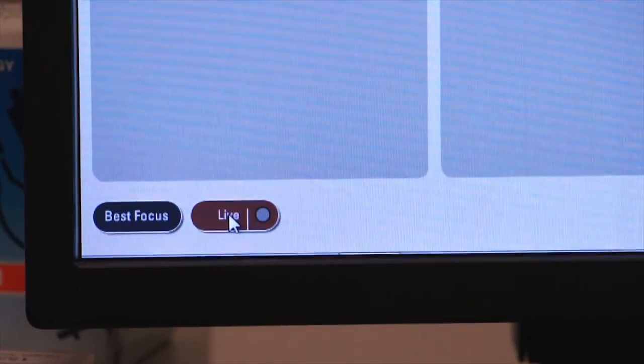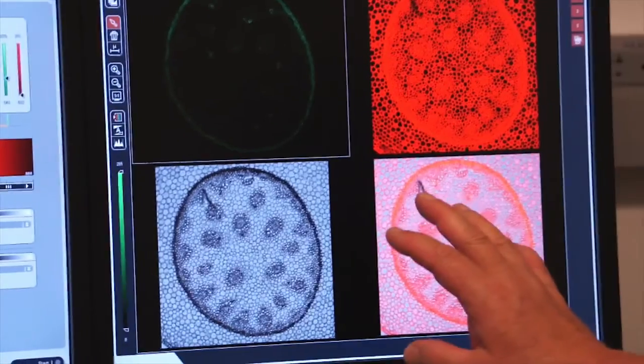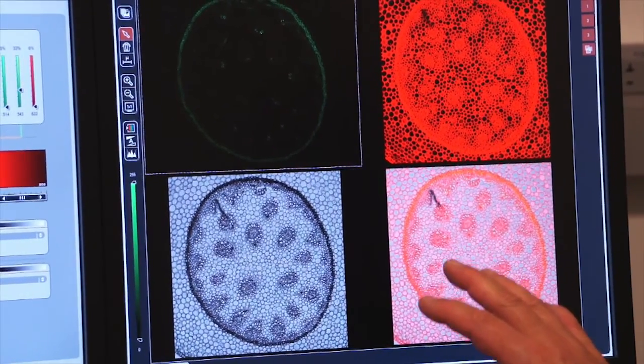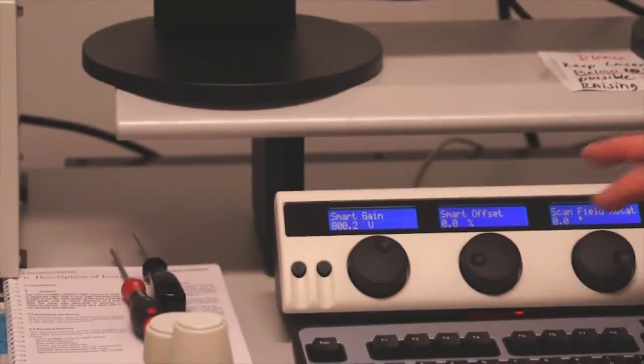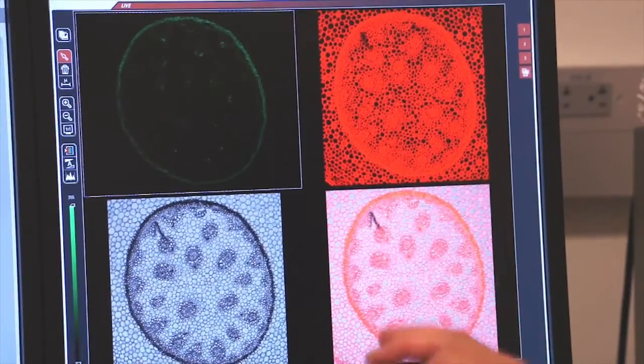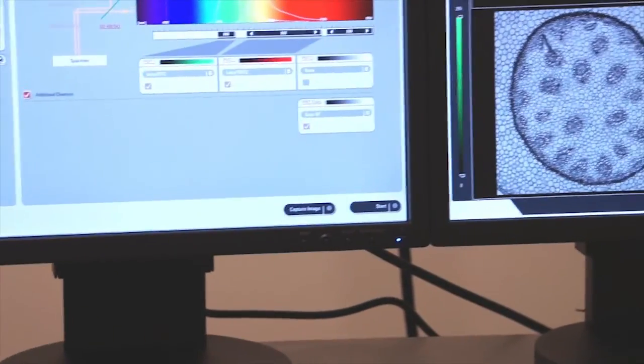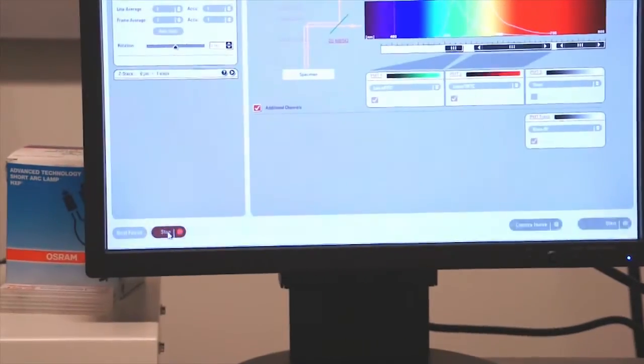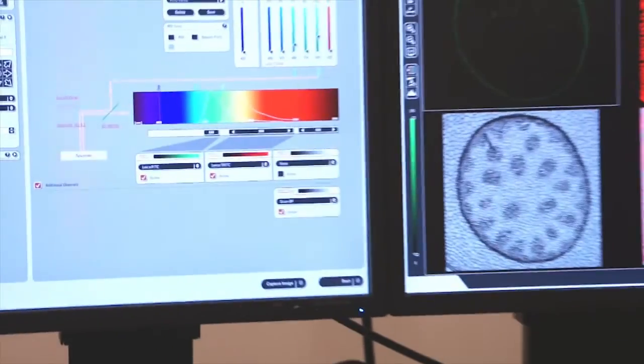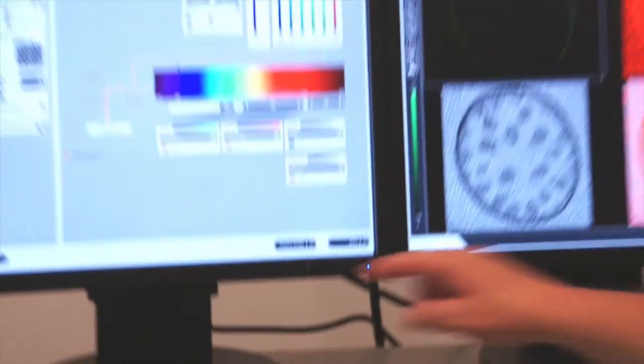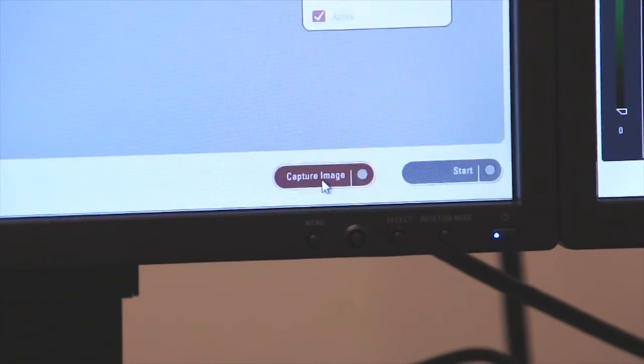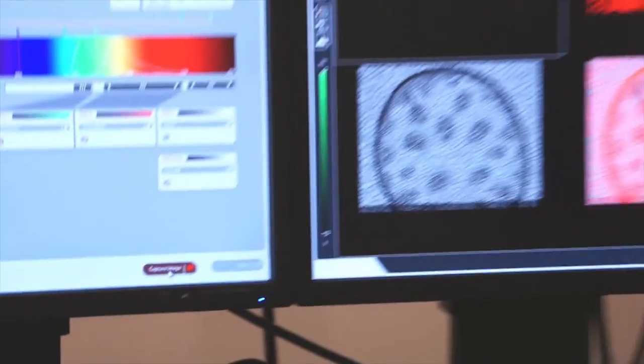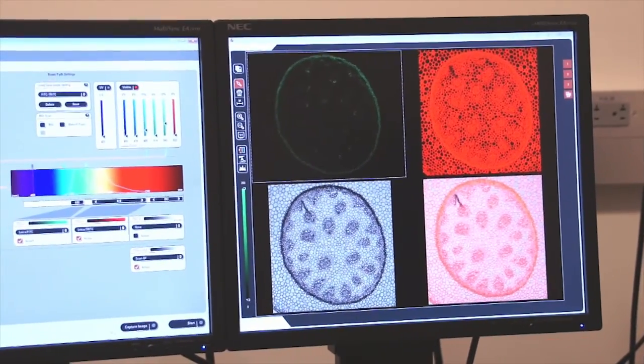So to look at my live image I'm going to click on the live tab and once I click on it I can see that I have a live image on the screen. At this point I can control my smart gain and my offset and make sure that my image is well balanced. If I want to capture an image then I press stop, turning off the live image and then I come over here and I press capture image and this will now capture an image with each one of the photomultiplier tubes that have been turned on.